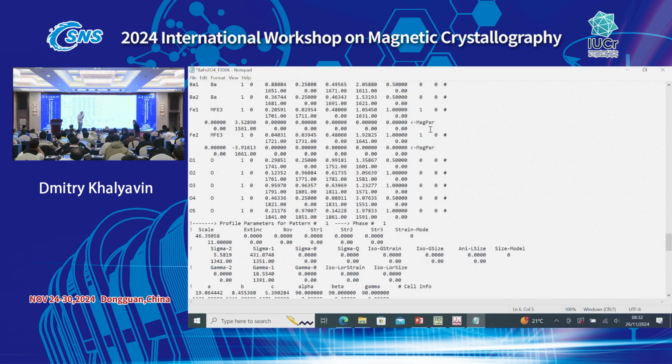If you cannot separate nuclear scattering from different phases, and you are trying to refine two magnetic phases and only one nuclear phase, then of course you need some additional constraints. Either on moment size, so you put a constraint that your moment size in the two phases is the same. Then it will eliminate the instability, and you should be able to refine. Otherwise it will be 100% correlation between phase fraction and the moment size.